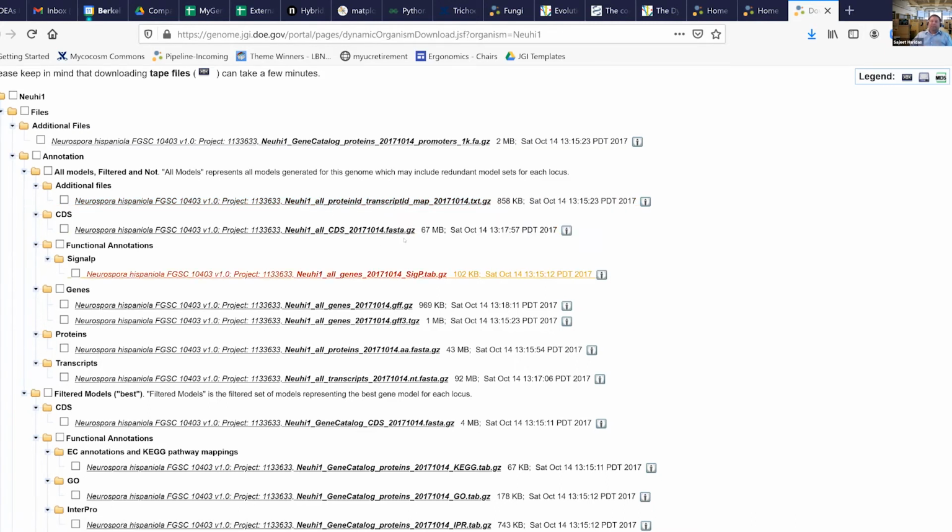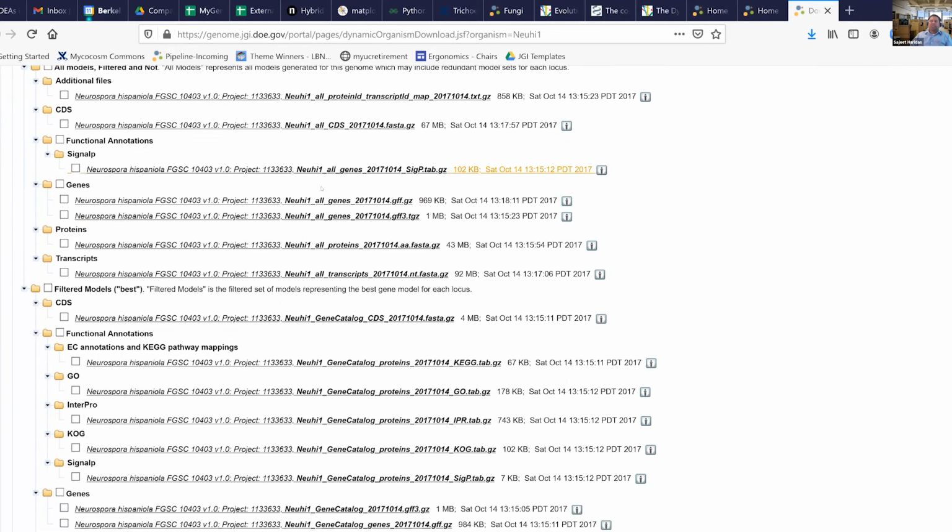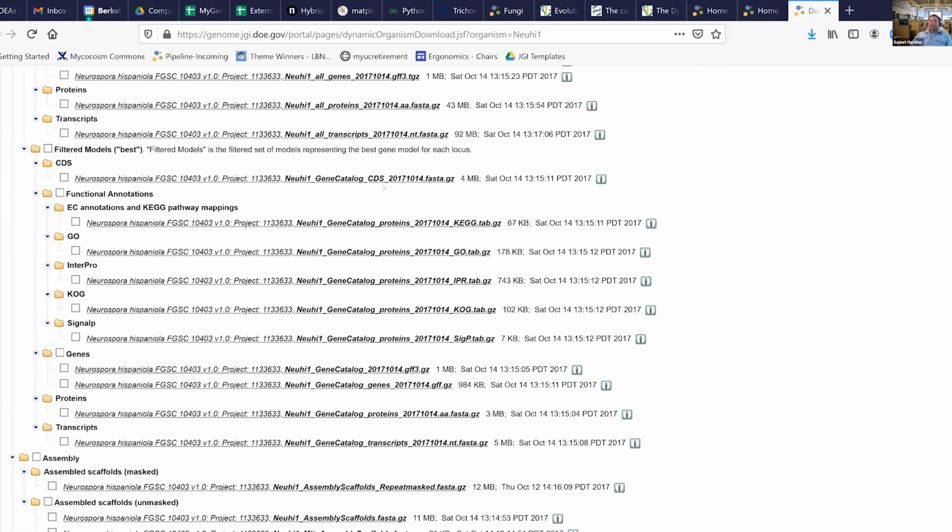As I mentioned, we have the all CDS and all genes. I hope this is self-explanatory. If not, type your question in again and I'll give you additional details. So for now, I'm going to skip this all because this is used by a very small subset of our users. The important part is here, gene catalog.